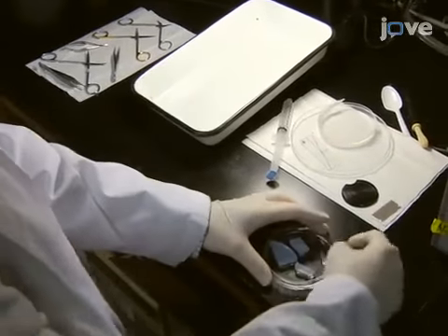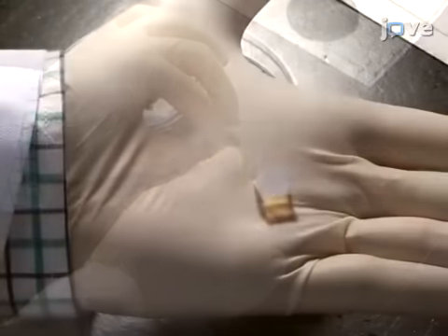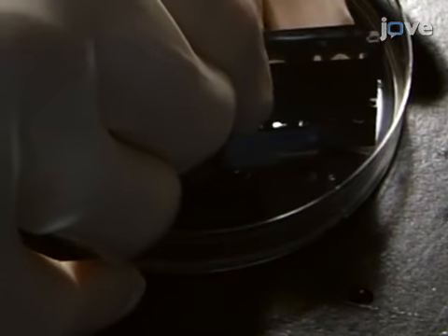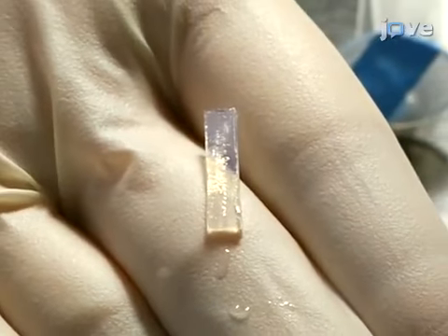To prepare the cutting stage for slicing, cut a small piece of 3% agar of approximately 1 cubic centimeter to be used as a backstop for the brain, and another piece of 1.5 centimeters by 1.5 millimeters by 3 millimeters to be used as a bump to support the inferior colliculus.